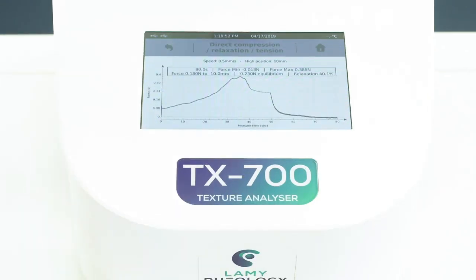At the end you will find some information and analysis as force maximum, force minimum, force at specified distance or relaxation.